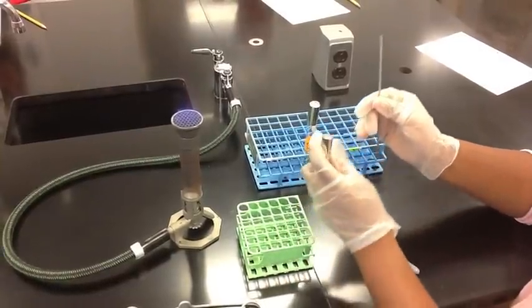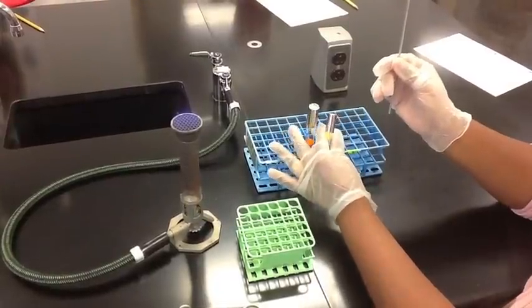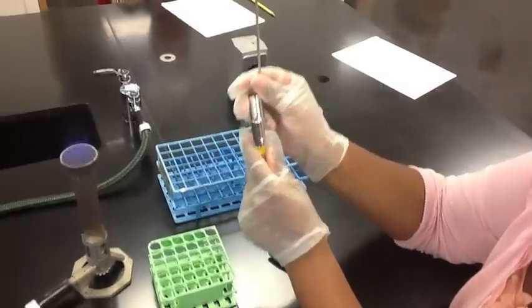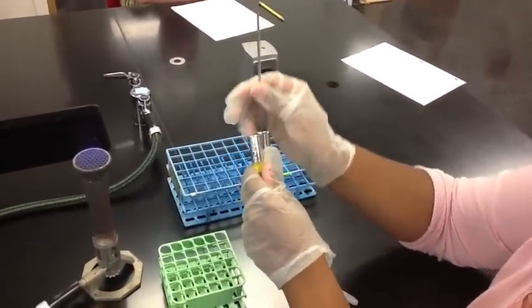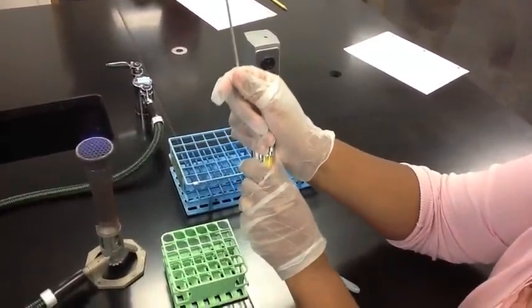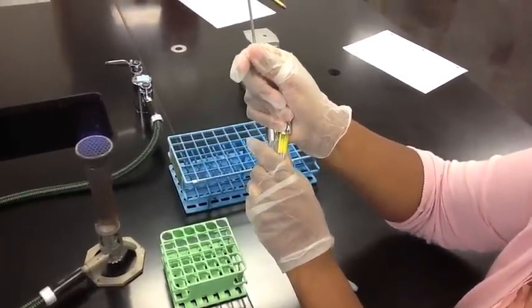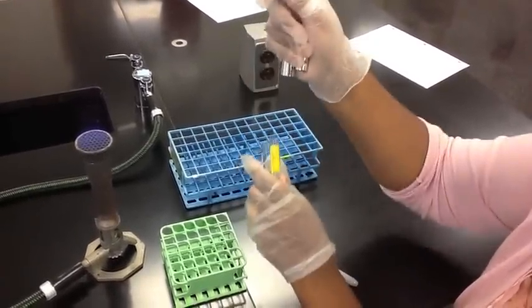To perform a broth-to-broth transfer while holding multiple tubes, you will hold both the original culture tube and the tube with the fresh broth in one hand. You will remove and hold both caps with the fingers on the hand holding the sterilized inoculating loop. Do not place either cap on the bench.